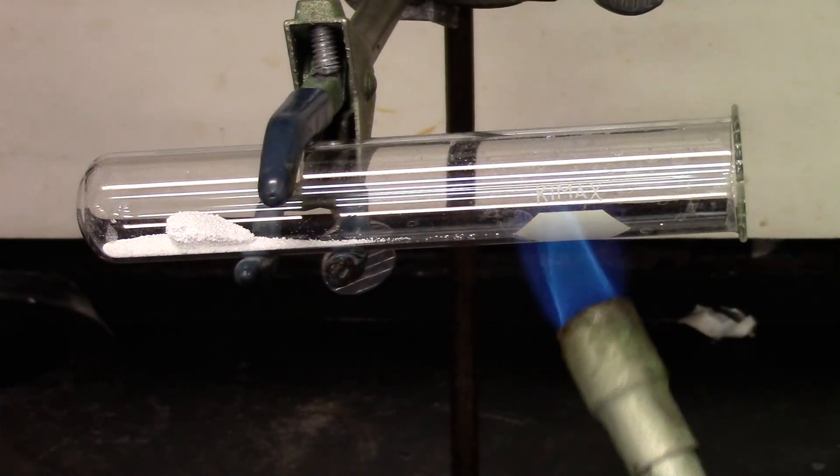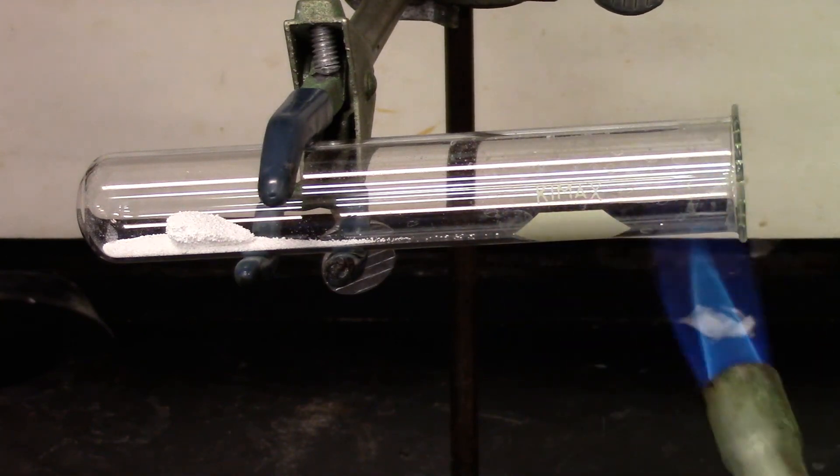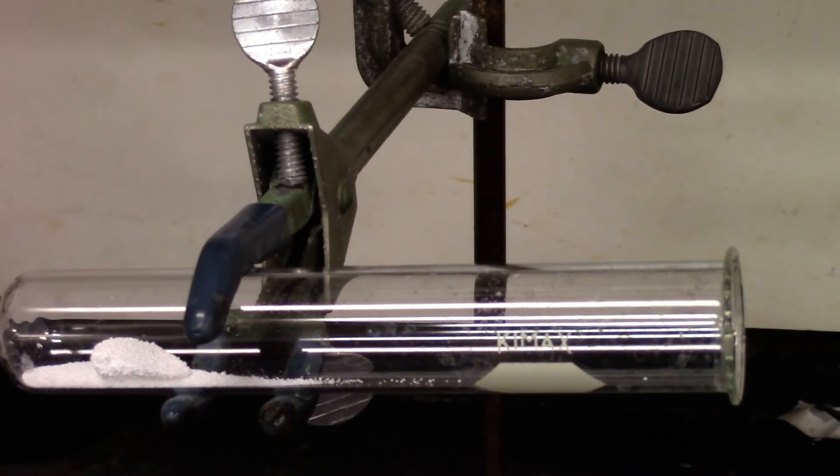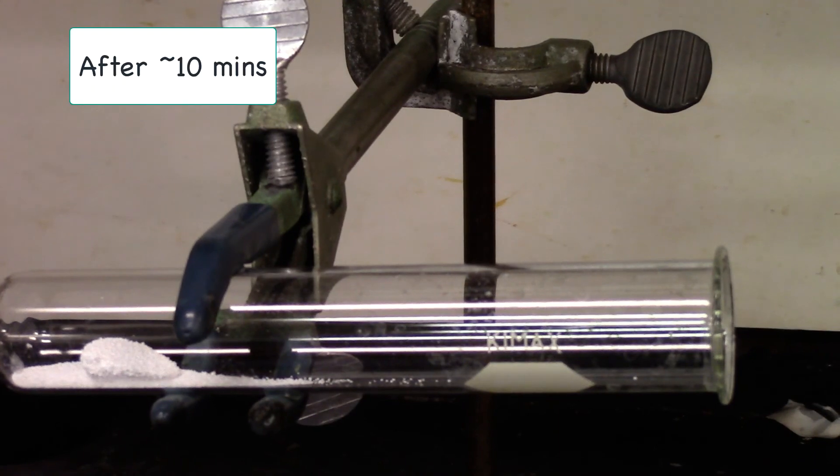If there is some plastic on the clamp, avoid heating the plastic. Otherwise it will catch fire. Now the test tube looks dry. I will let it cool down and weigh it.